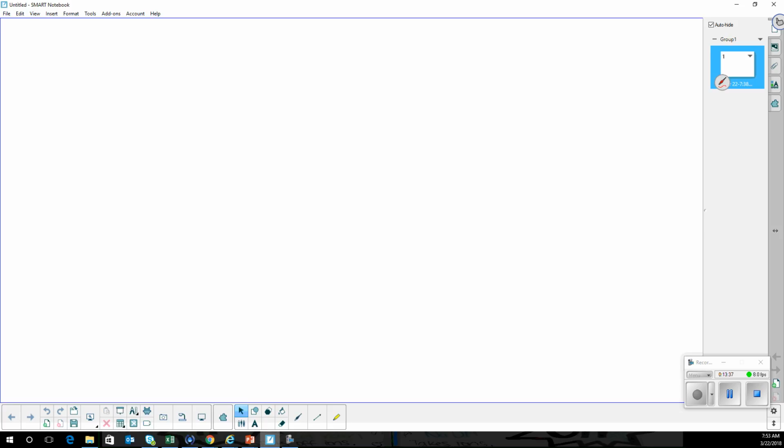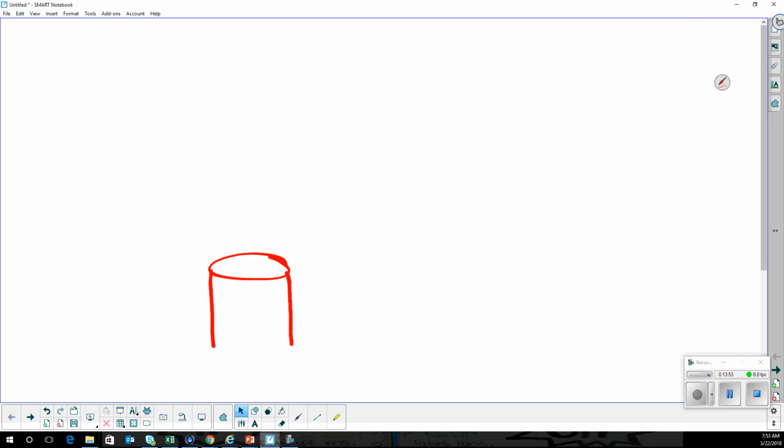Okay, so you know what you're doing. Now, if I told you acid, that means you're going to put the acid in the burette. If I told you base, you're going to put the base in the burette. What goes in the bottom is always the buffer. I've already made up the buffer for you. You're going to use your big beaker and get 5 milliliters of buffer.